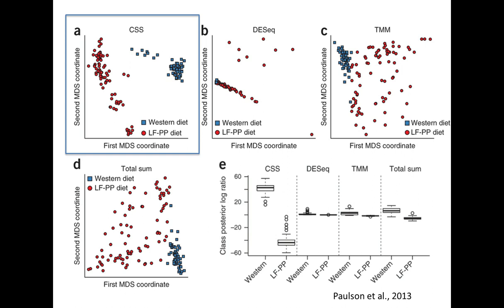Because if you're going to be doing PCA analysis, that's what's represented here. These are PCA or multidimensional scaling plots. They allow you to see the most variable components in a data set, which here you see the greatest variability happens to be biology. If you're going to add less than 1, once you log transform, you're mapping a 0 value to a negative, and so the greatest variability is going to be between what is present and what is not.